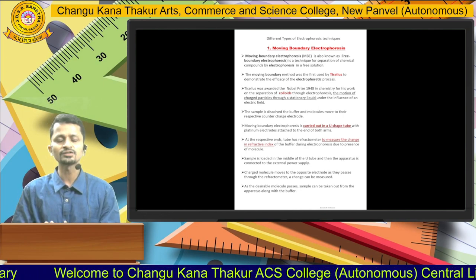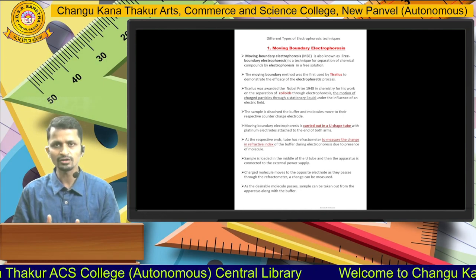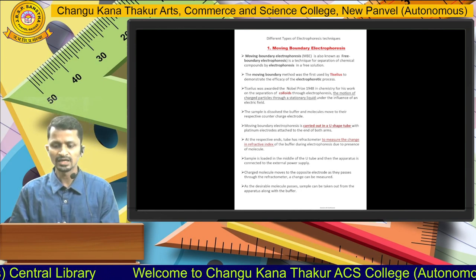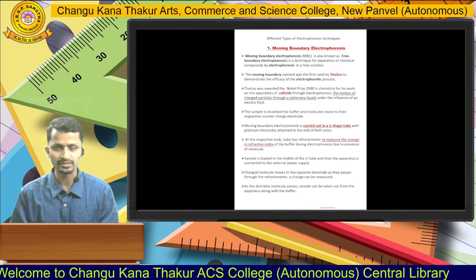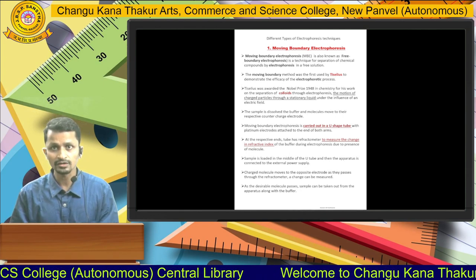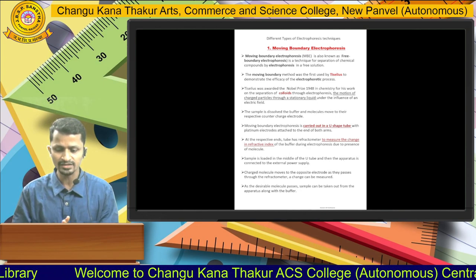Now the moving boundary electrophoresis is also known as the free boundary electrophoresis technique, where the migration or movement of charged molecules takes place in the solution freely. This moving boundary electrophoresis was first invented by the scientist Tiselius, and for his work he got the Nobel Prize in 1948, where he separated the colloids. Colloidal particles are also charged particles. So Tiselius separated these colloidal charged particles for the first time using the electrophoresis technique. So he got the Nobel Prize in 1948.